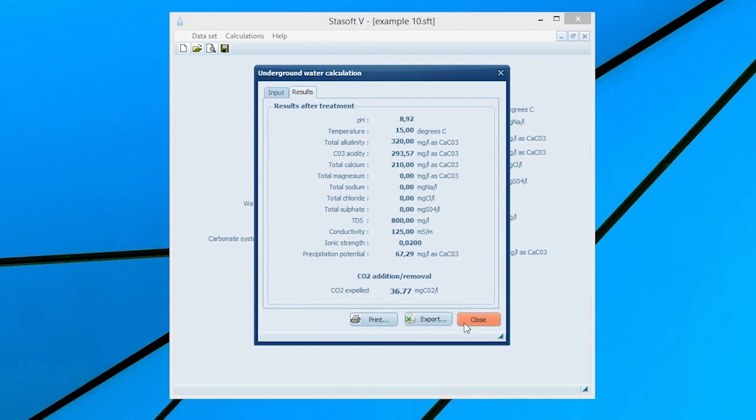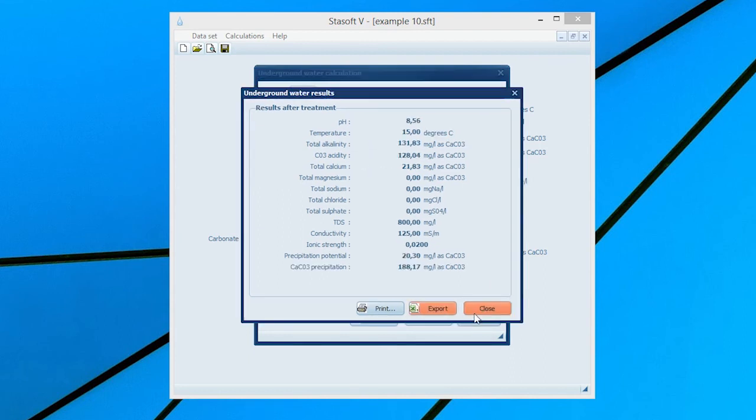Selecting the Close menu option will bring the Final Results After Treatment window onto the screen with values for the final state of the water and the amount of calcium carbonate that will precipitate after three-phase equilibrium has been attained by the water.